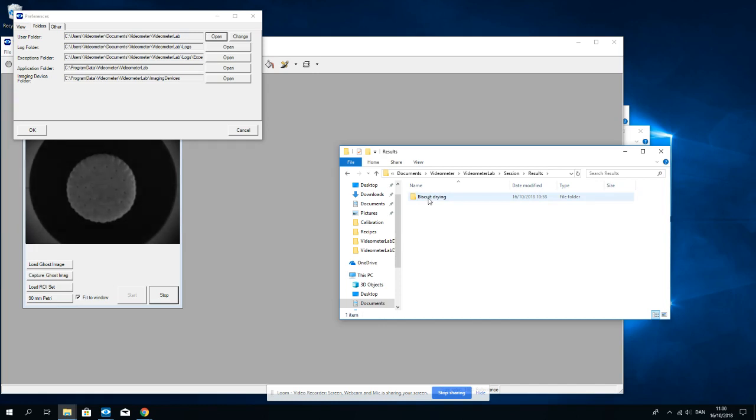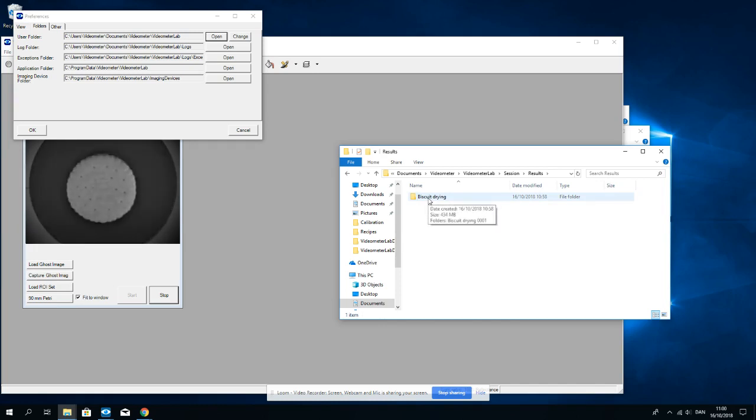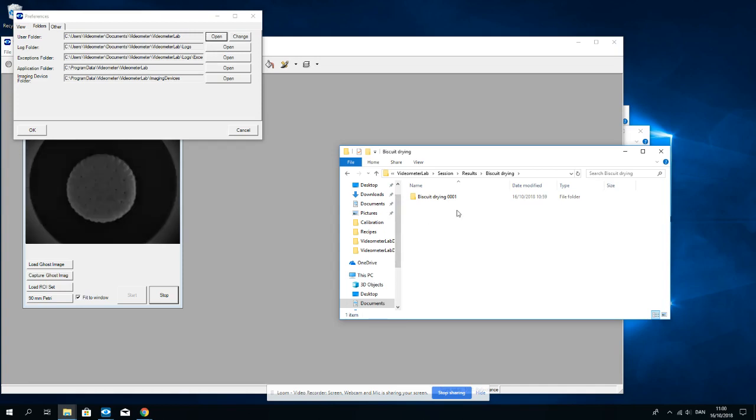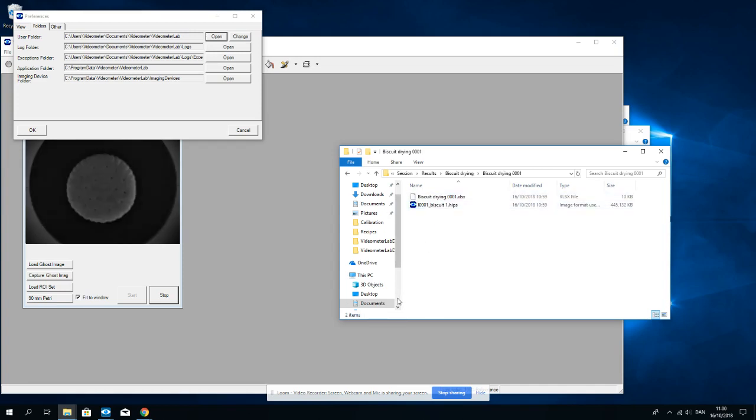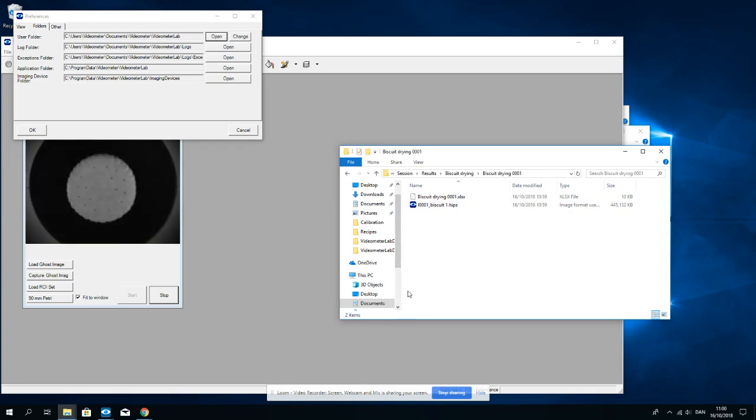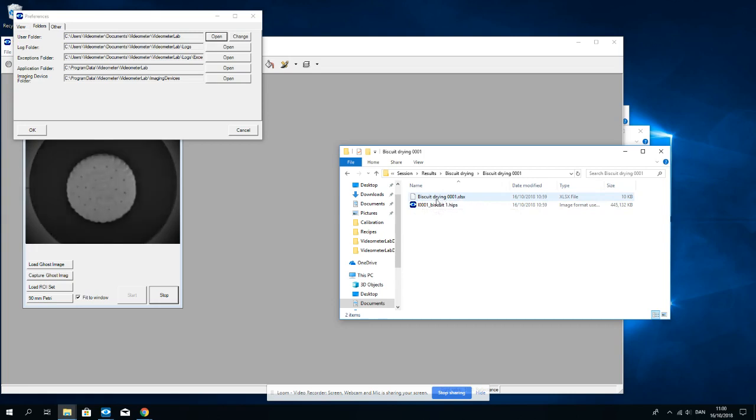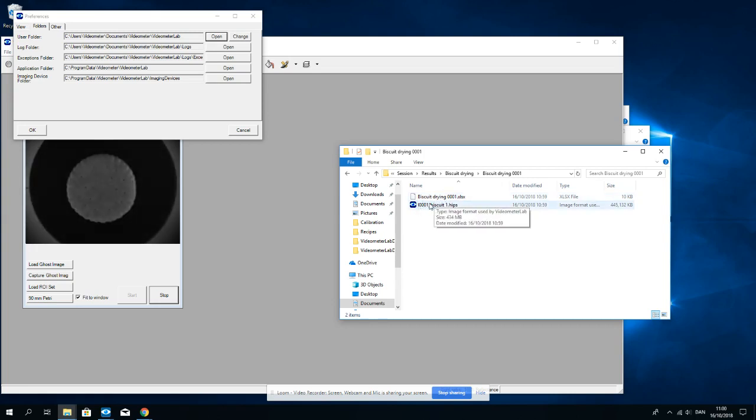Biscuit drying is my session and I have run it one time and these are the results of this session. So I only let it acquire one image.